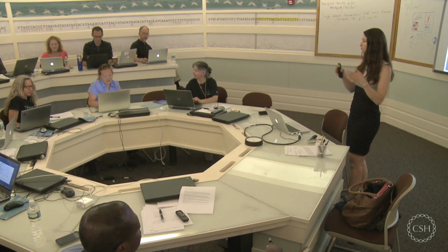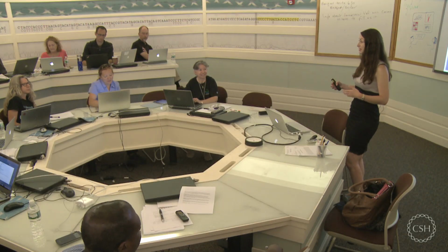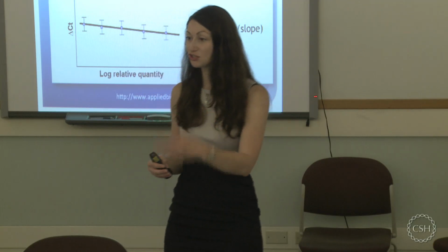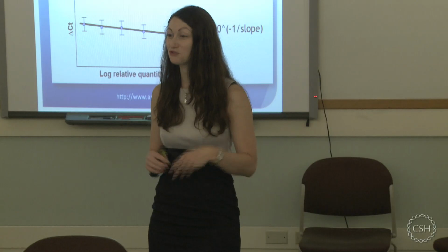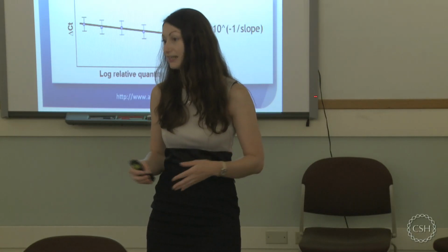So for 1, 2, 4 nanograms, you also would expect 2, 4 fluorescent units. If that's not the case, for example, because your primers form a little bit of primer dimers and you have additional fluorescence, or for any other reason which happens in your tube, you have too much fluorescence, then you get an efficiency of 105 or even more than that.